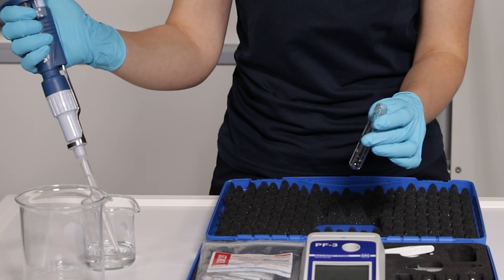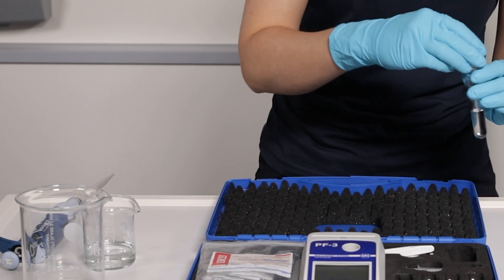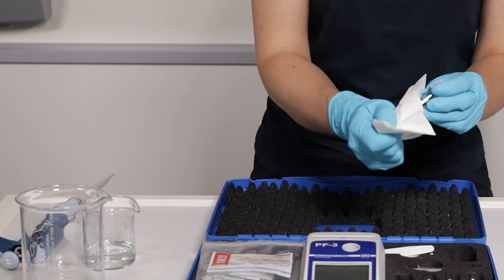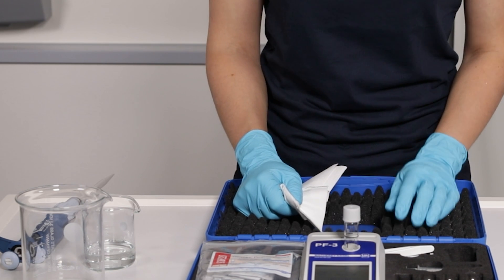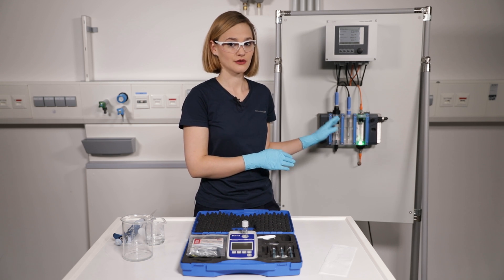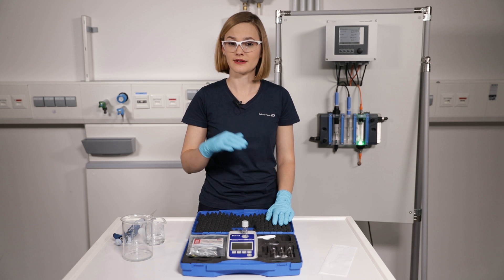Rinse the cuvette several times and then fill in the blank sample. For the photometer measurement, the cuvette has to be very clean — no fingerprints on the outside or gas bubbles on the inside. Insert the clean cuvette into the photometer and perform the zero measurement. Try to bring your DPD photometer close to the measuring point to perform your measurement as soon as possible after sample grabbing. Don't waste time, because the free chlorine concentration in the sample will decrease constantly.